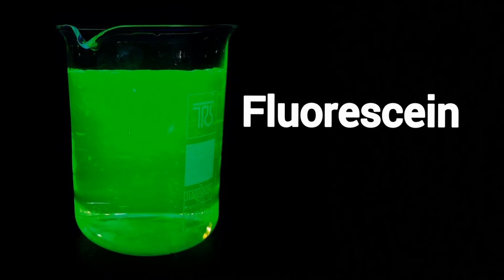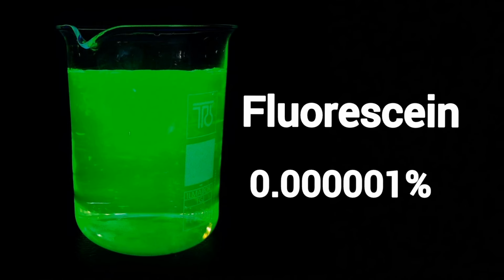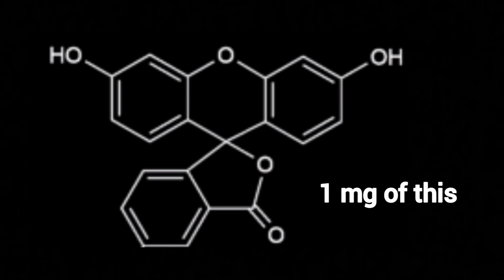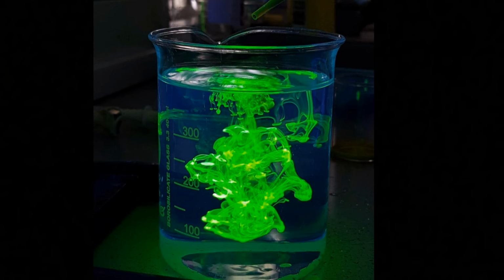This is fluorescein. Well, actually, only 0.000001% of this is fluorescein. You see, fluorescein is an extremely fluorescent organic dye commonly used in medical imaging due to its very low toxicity, and just 1 milligram of this stuff is able to make a whole liter of water fluoresce brightly.